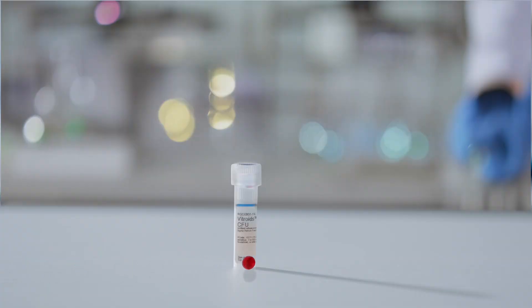See how to apply these discs to inoculate agar plates or liquid medium, dilute a suspension, or use in membrane filtration.